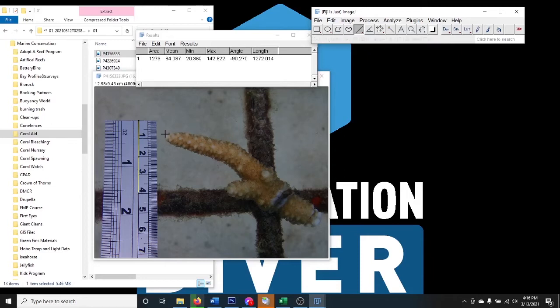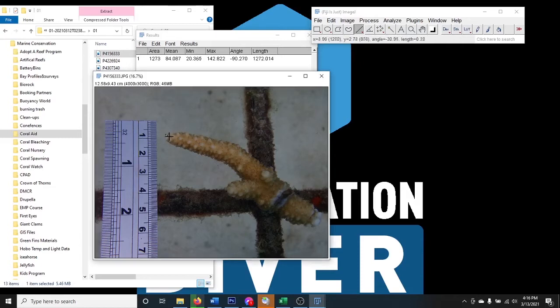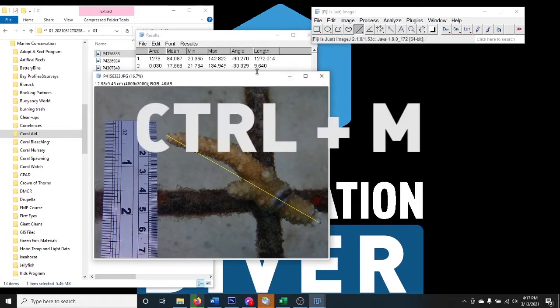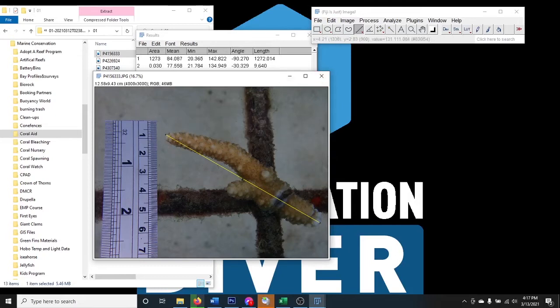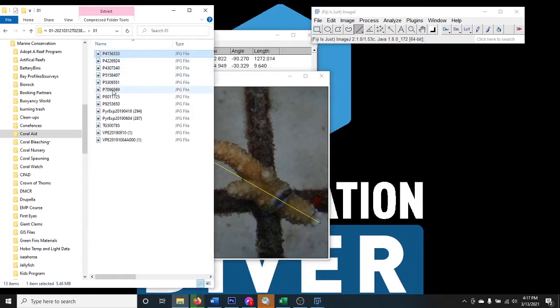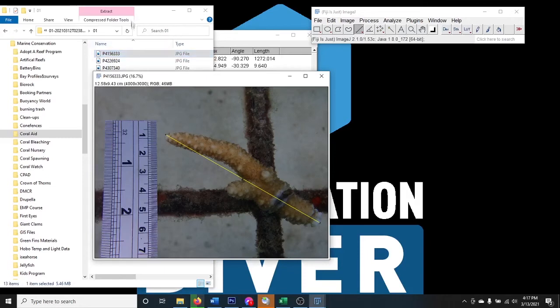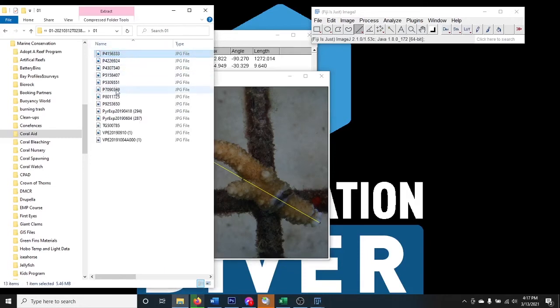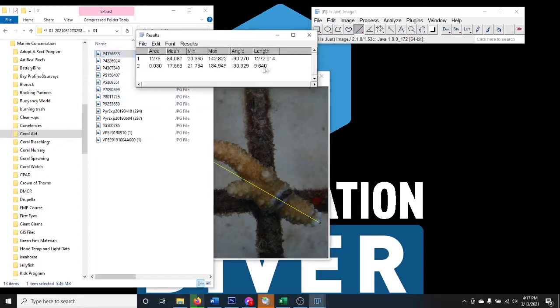Now we can measure the coral. Still using the straight line tool — this is a branching coral so I'll measure along one axis throughout all photographs. I grab the extreme point on one end and drag to the extreme point on the other end, then hit Ctrl+M. This time I get the length in centimeters: this coral length is 9.64 centimeters. I could put that into my Excel file and move on.